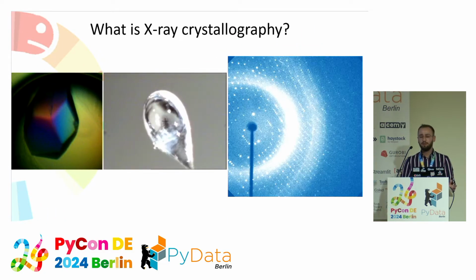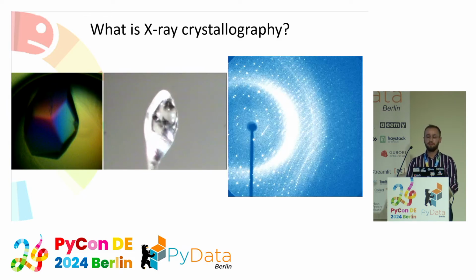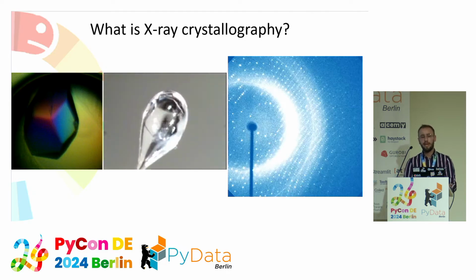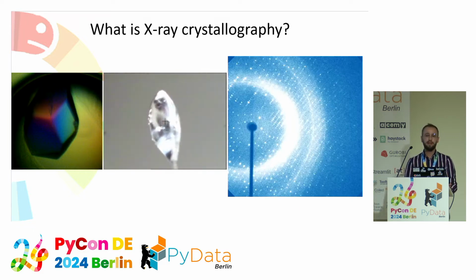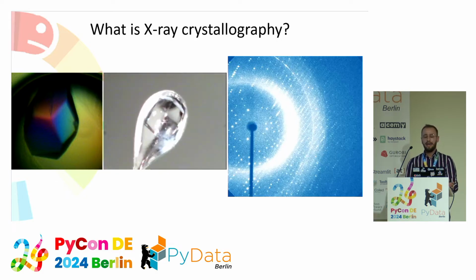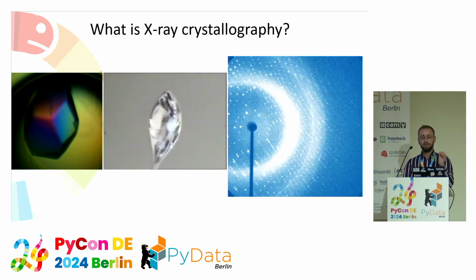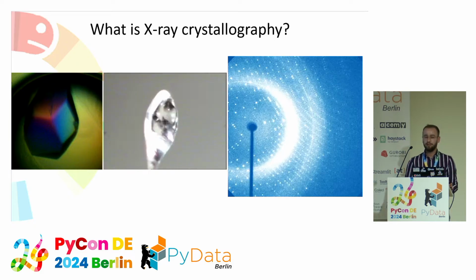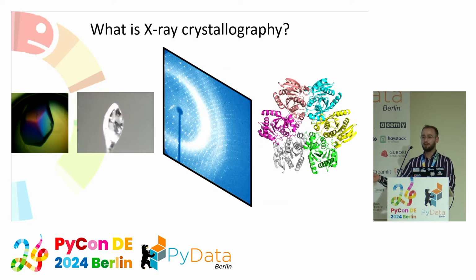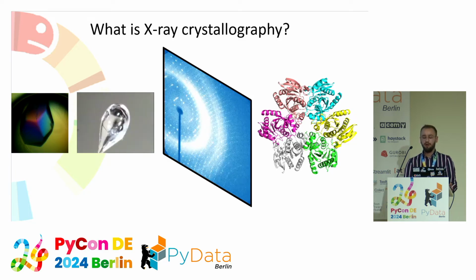So Zoran and I, we are doing crystallography. We are crystallographers. And what is crystallography? It is a study of structures of molecules and biomolecules that can be solved from crystals. From small molecules, for example, like salt, sugar, you can imagine that these are crystals, but proteins also crystallize. With crystallography, we use X-rays to pulsate onto the crystals, and we get these diffraction patterns from which we get structures. The step between the diffraction pattern and the structure is all computational stuff, and we eventually get structures of the proteins.